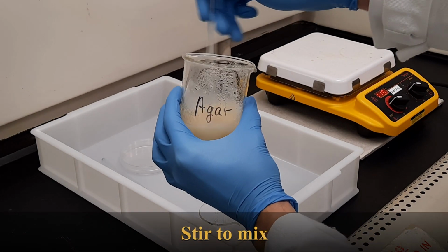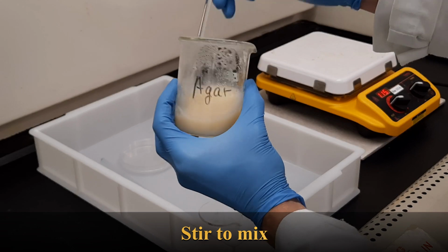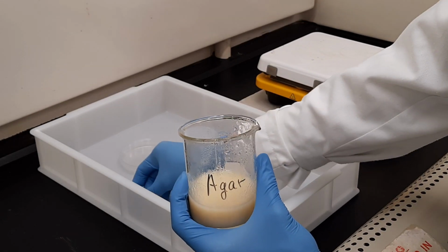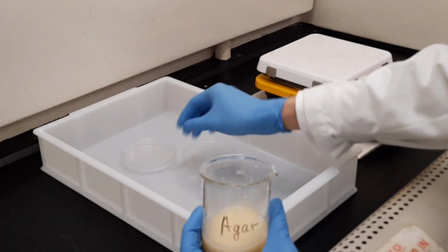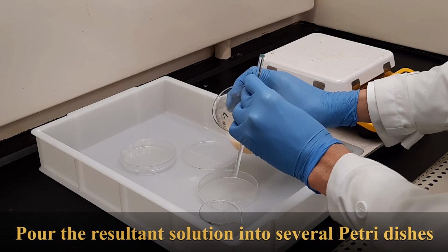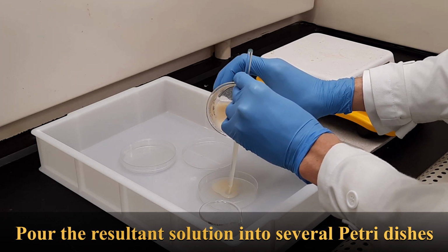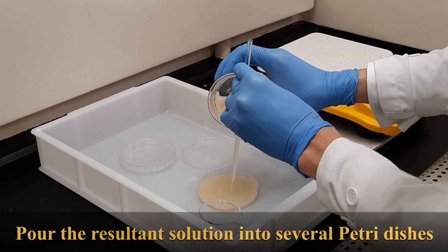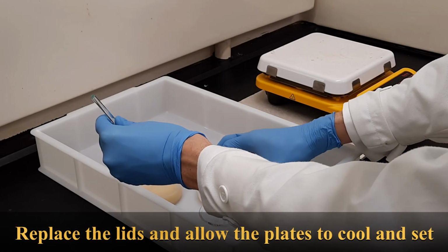Stir to mix. Pour the resultant solution into several petri dishes. Replace the lids and allow the plates to cool and set.